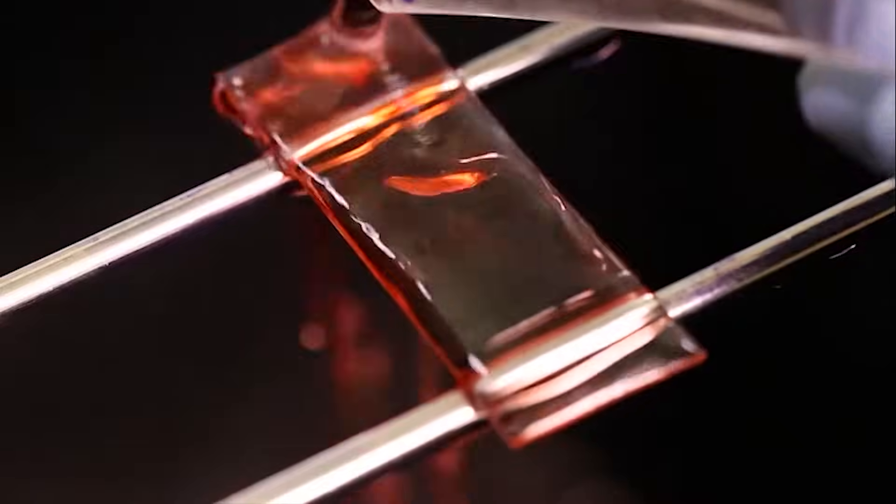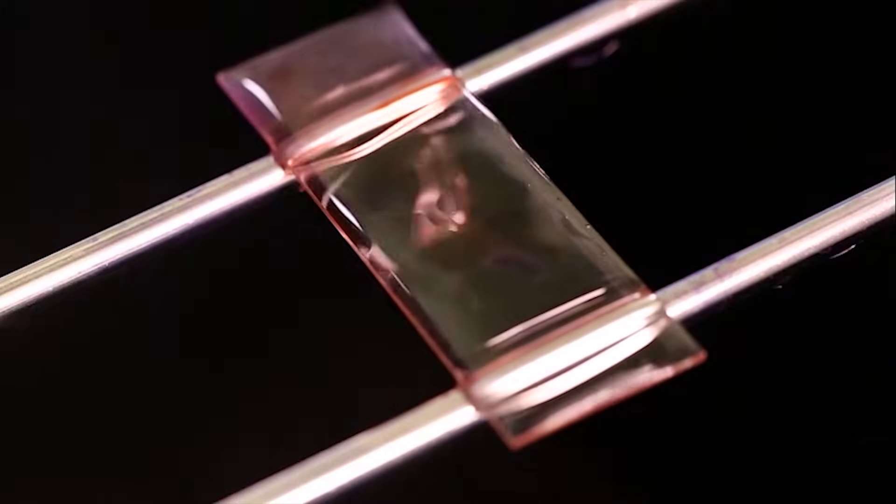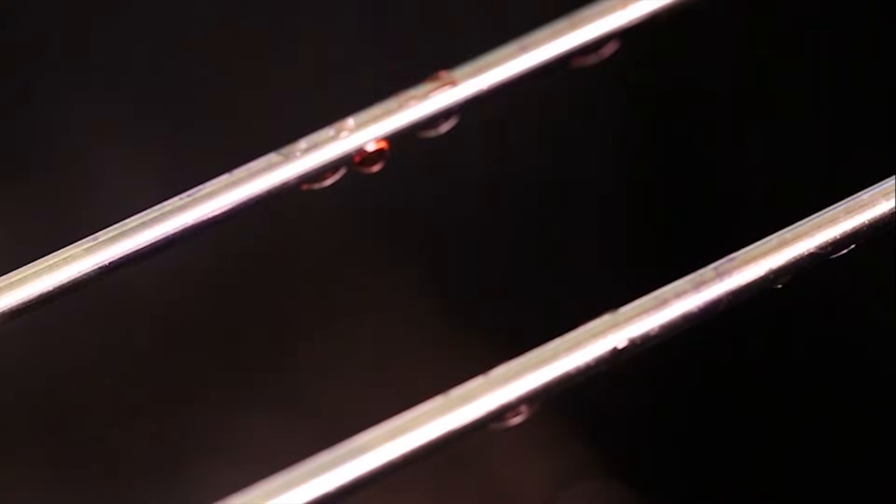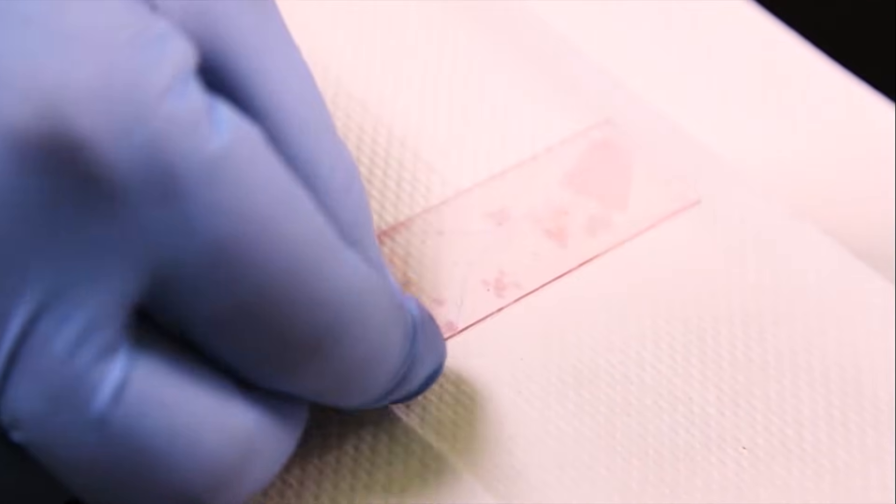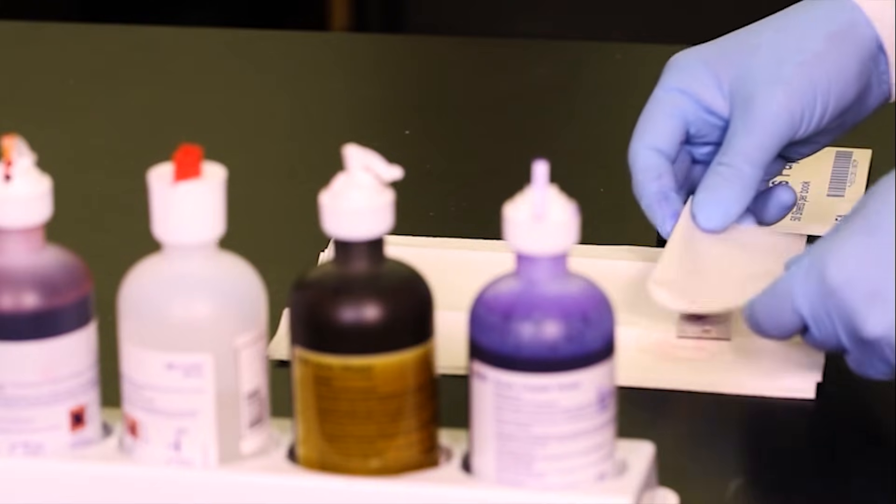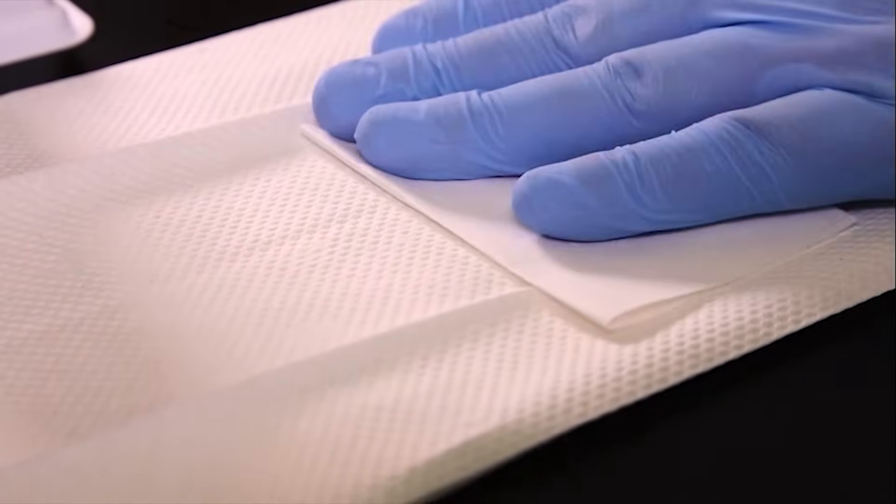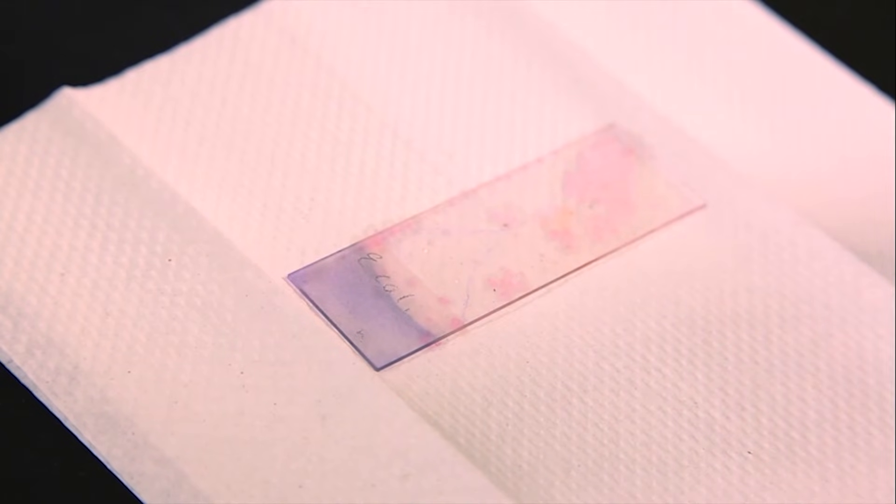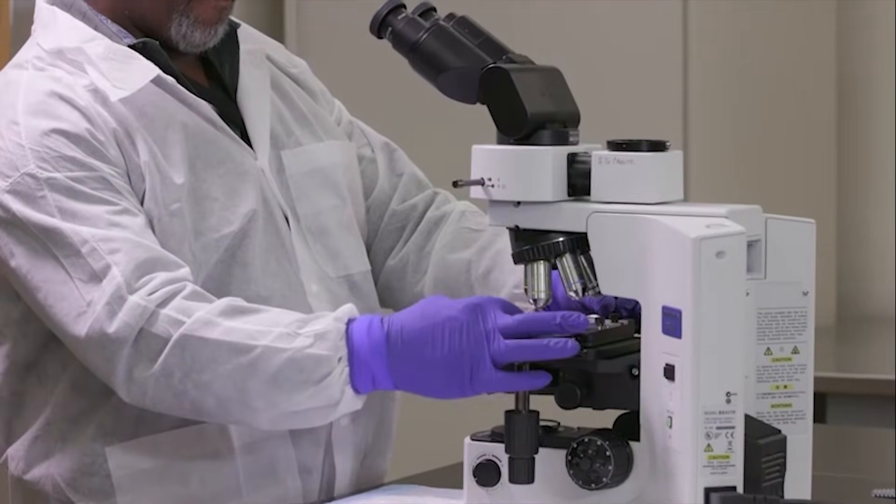Tilt the slide to remove any excess water. You can gently blot the slide with bibulous paper, but be careful not to wipe the smear off the slide. Then allow the slide to air dry. Once the stained slide is dry, it is ready to be viewed under a brightfield microscope.